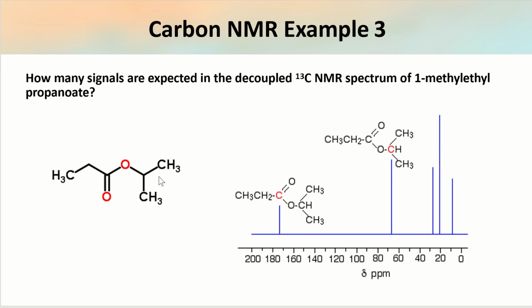But clearly these 2 methyl carbons would be in the same environment, so that would be 1. And then we already counted that. And then we have this one, this methylene, and we have our methyl.